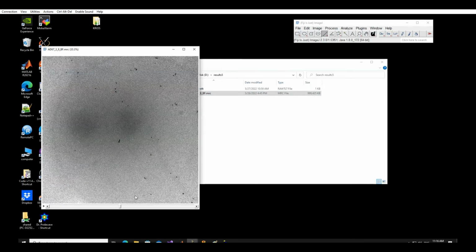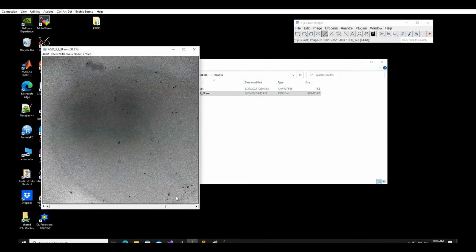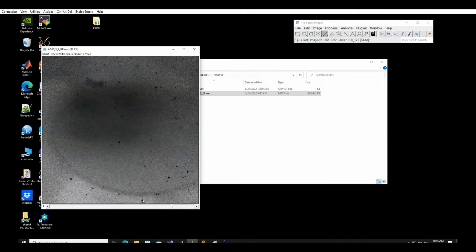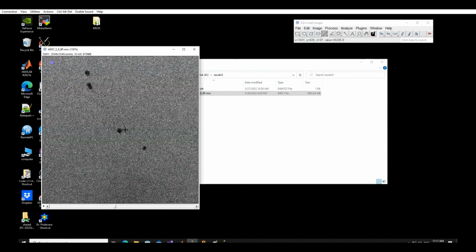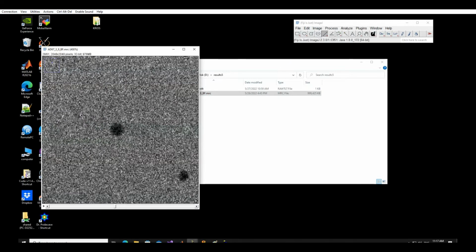The order of the tilt views is from -60 to +60 degrees, in steps of 2 degrees. We observe that the tilt axis is horizontal, so the rotation axis is the x-axis. The fiducials are dark, since it is a bright field image. There are about 40 fiducials in the center projection, and we ignore those particles that enter the screen only at high tilt angles. Now I will estimate the diameter of an average fiducial.